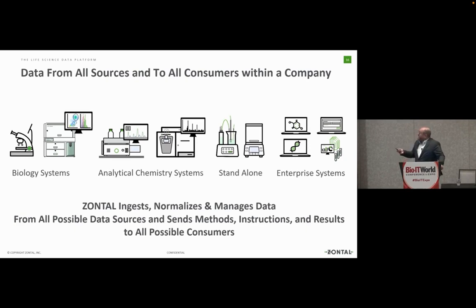Okay, so just for this first part of the talk, really the idea is that we can have biology systems, all kinds of chemical systems, standalone systems, whatever, your scales, your pH meters, and we're connecting this to the systems that are used by the scientists, or that they have to use, like SAP. So we're ingesting and normalizing that data. We're preserving it, but we're also making it available for further analysis.